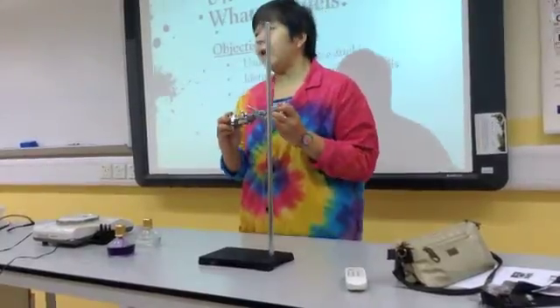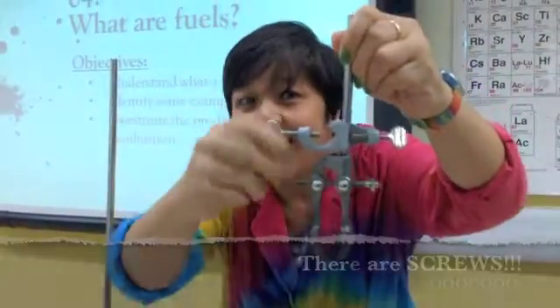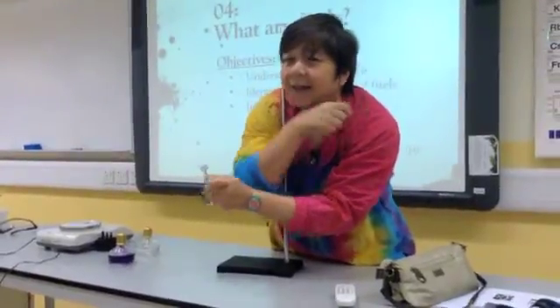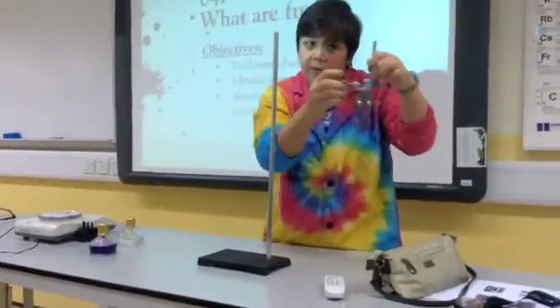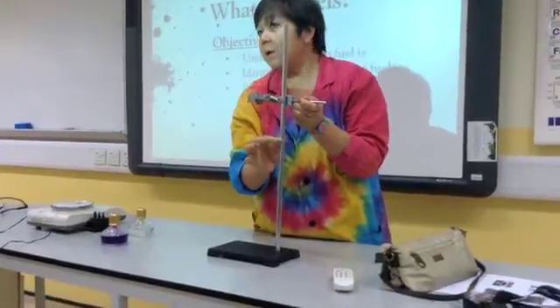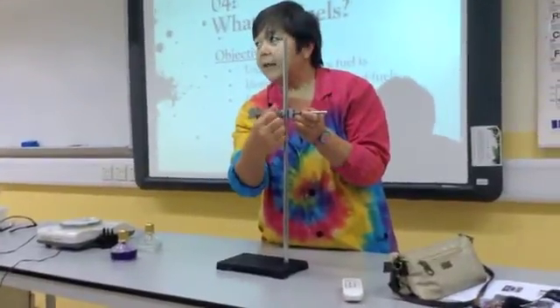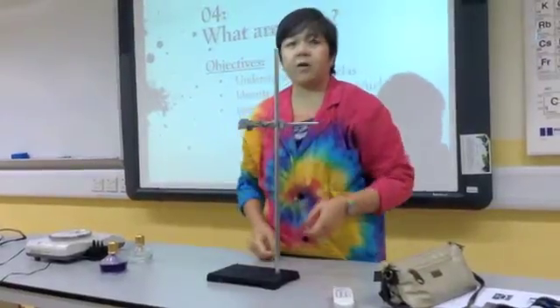How do I attach the clamp? If you look closer, there are screws over here which can tighten or loosen it, because what you want them to do is to embrace the retort stand. I need to loosen this — I'm loosening it so I can clamp it on the retort stand. And then I have to tighten it so that it stays clamped to the retort stand.